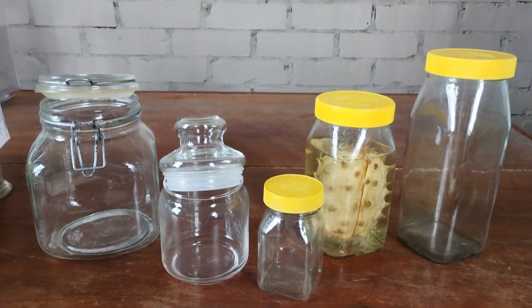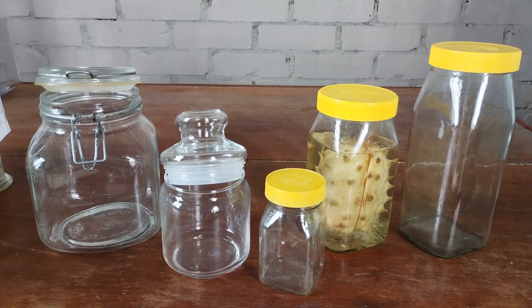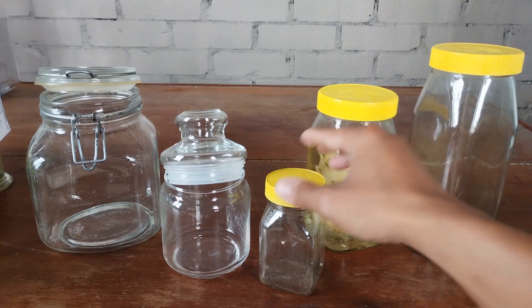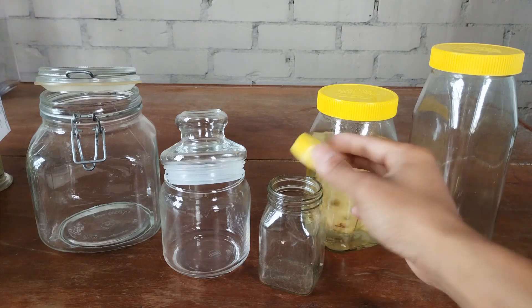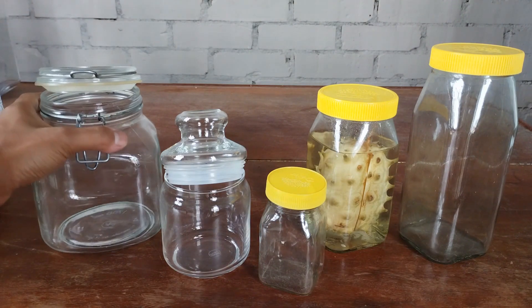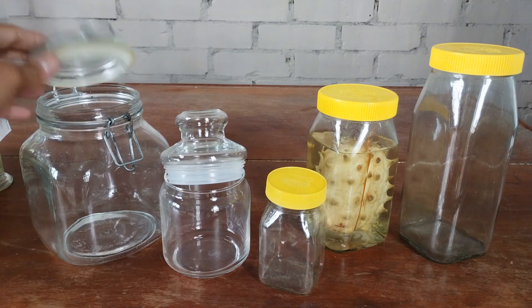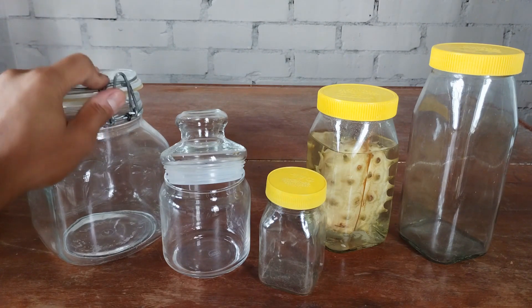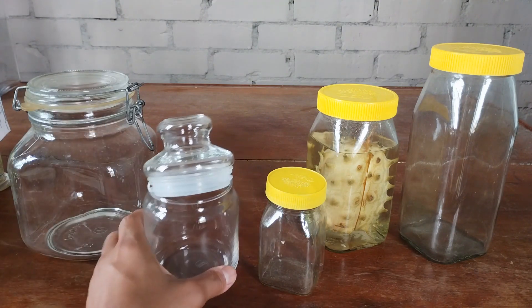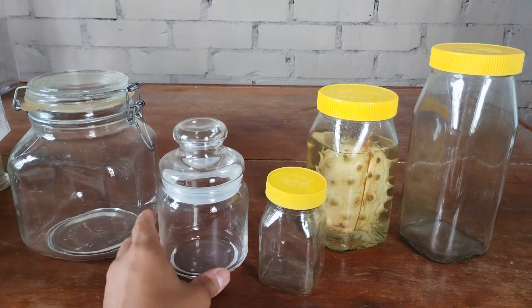Certain kitchen containers can also do a great job at preserving a wet specimen for a long period of time, if not indefinitely. Honey jars of different sizes with tight-fitting plastic screw caps with an inner lining made of thick paper work well — to ensure an even tighter fit, you can add a couple of layers of polythene on the mouth before screwing the lid. The familiar clip-type jar with a silicone gasket is in fact used in some museums and institutes as wet specimen containers, as the silicone gasket combined with a metal ring clip ensures a very tight seal. Pop jars also come in different sizes and work as effectively as clip jars for long-term specimen storage.